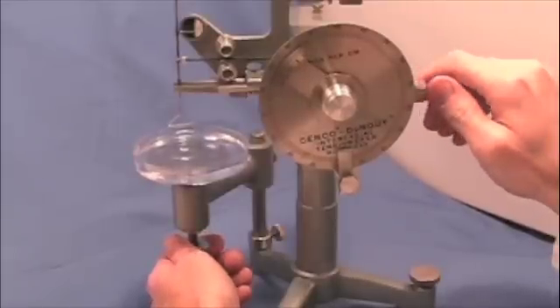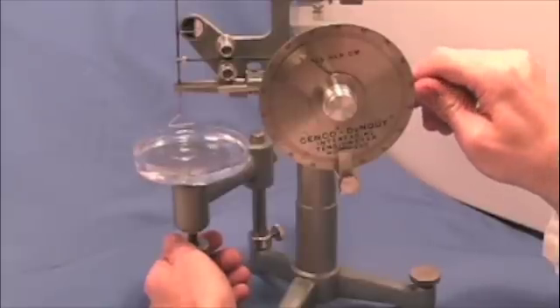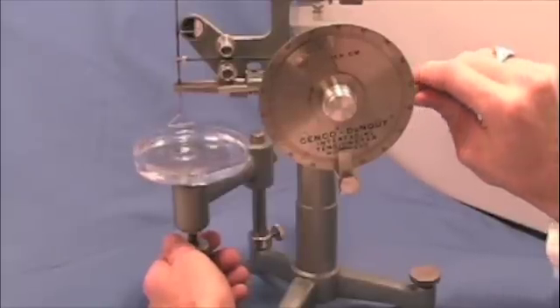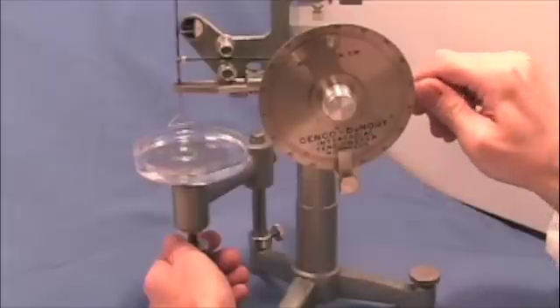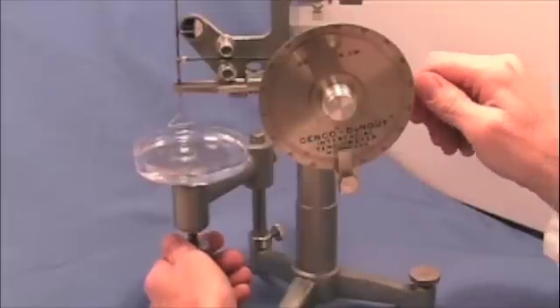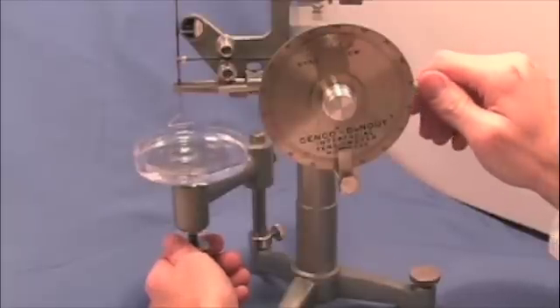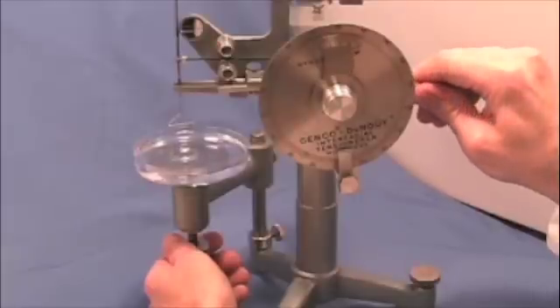That'll bring it back and measure the actual force of the strain. So we're level again — drop the table a little bit more, compensate and adjust with the right hand until the needle is just about level. It's level now. Lower it. Adjust again with the right hand. Lower a little bit with the left. Adjust with the right hand.